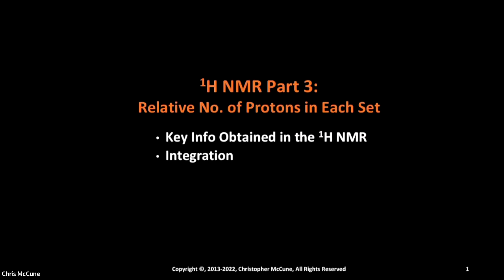Hello, in this video, I will cover the relative number of protons in each set, which infers the integration. This will be a fairly short video, just covering the concepts of what integrals and integrations are. This continues our proton NMR videos. This is the third installment of four plus an overview, so 5 total.